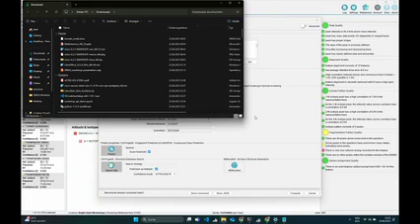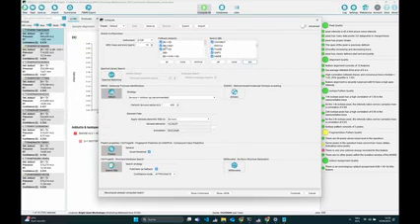So I wanted to ask, we have talked a lot about the confidence score, but what about the SIRIUS score, and in which situation would you look at it more than the confidence score, or if there is any? Yeah, so in general, for you as a user, there is not a good reason to prefer the CSI FingerID score over the confidence score.